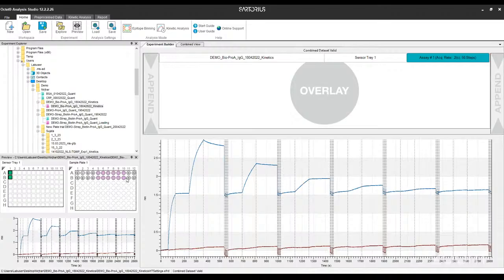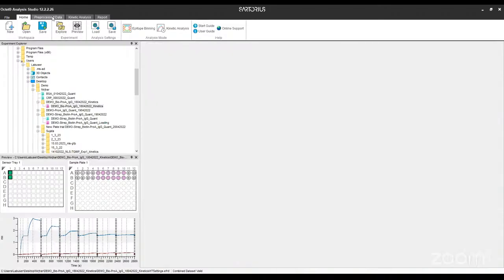One step we might have missed in saying is that there's a regeneration after every association and dissociation, where the analyte gets dissociated completely from the ligand so that the new association can happen from almost base level 0. So that's what that regeneration is about. It doesn't take off the ligand from the sensor, but it definitely takes off the analytes which are bound.